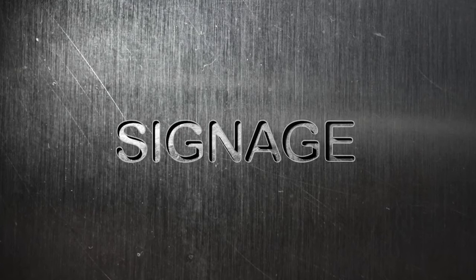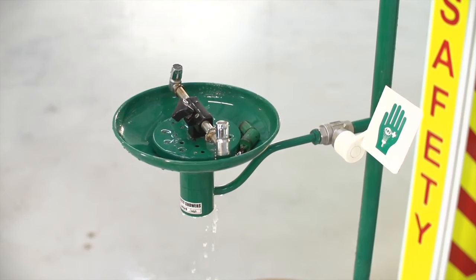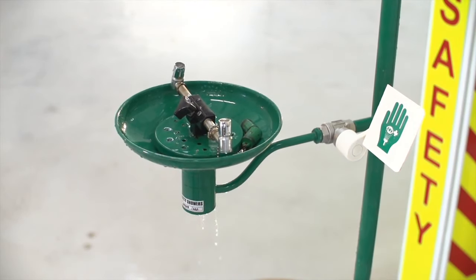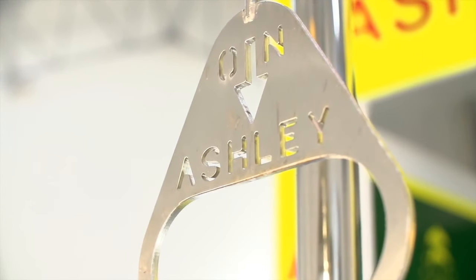Signage: Stickered signage can fade and peel off, deteriorating the look of the shower and even confusing the user as to where the activation points are. Ashley's signage is laser cut into the steel itself.